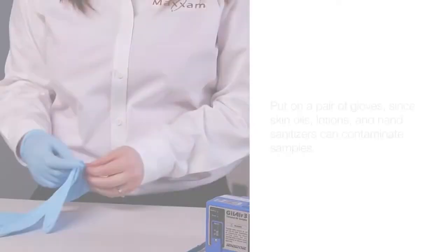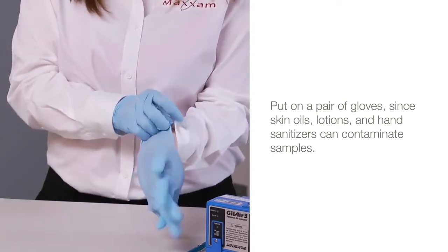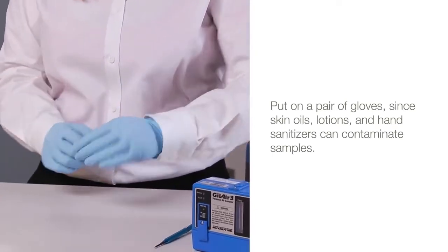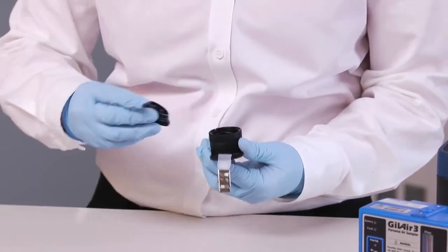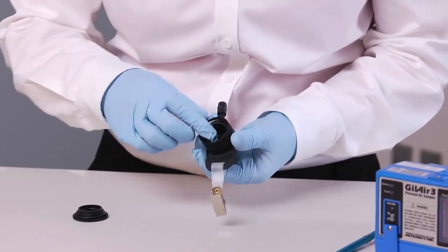First we'll demonstrate how to load an IOM cassette into the sampler body. Put on a pair of gloves since skin oils, lotions and hand sanitizers can contaminate samples. Remove the faceplate on the IOM sampler and examine the inside to ensure the o-ring is intact.